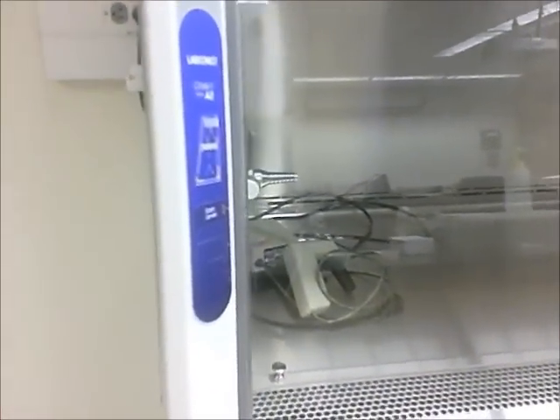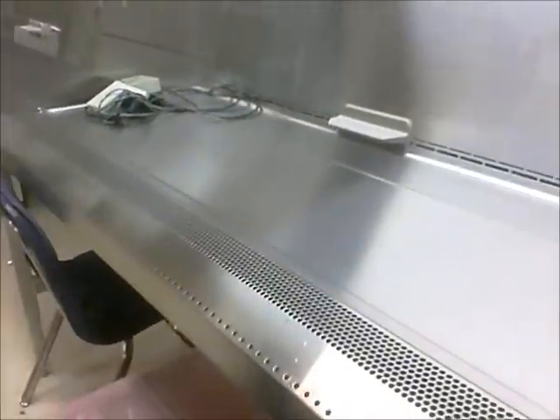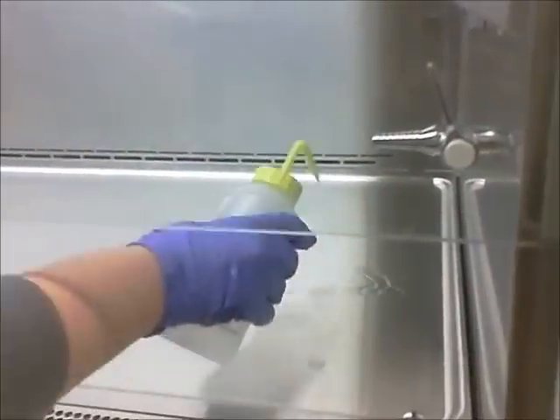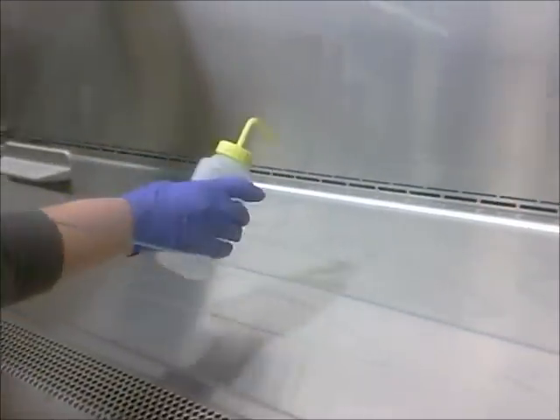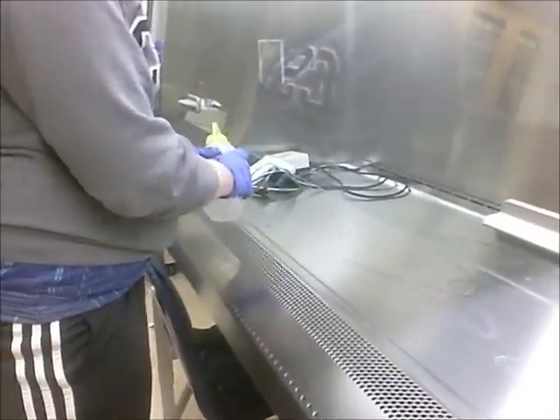We're here in Cal State San Bernardino's cell culture lab and we're going to get started on passaging cells. First we need to lift up the hood to the sash level, turn the blower on, and add the light. Then we're going to begin cleaning the hood with ethanol, making sure to clean our hands and all the surfaces and instruments we're going to be using. We'll be using kim wipes to wipe down the hood.